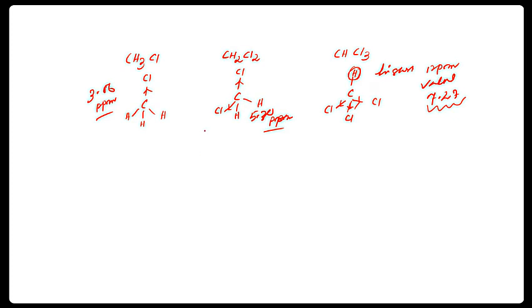Okay. Now, dear students, if I ask a question based on the discussion, let's say this is the molecule. This is methyl. If I ask you how many methyl protons you will observe, how many methyl peaks? Basically, the reply is that these are equivalent. We will expect one methyl peak because these are equivalent. So we will expect normally one methyl peak.